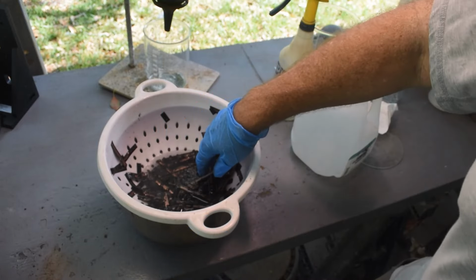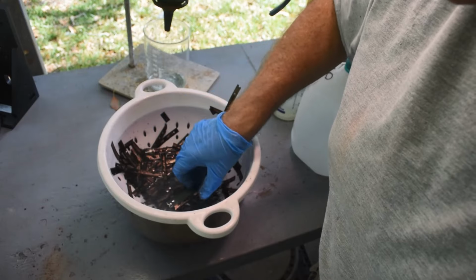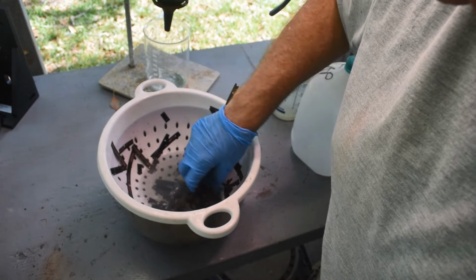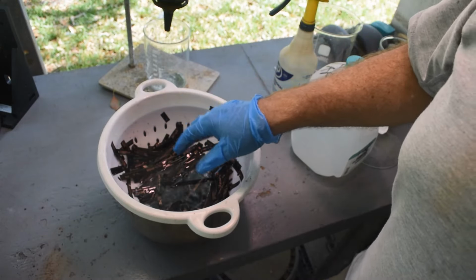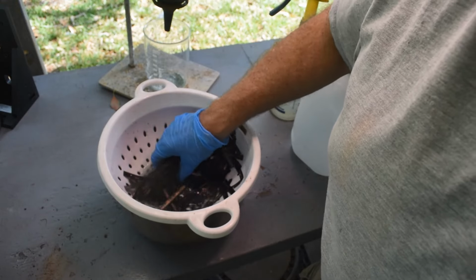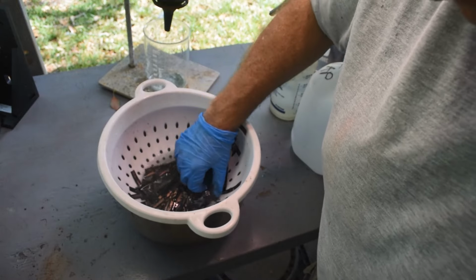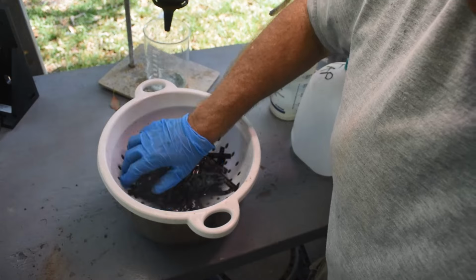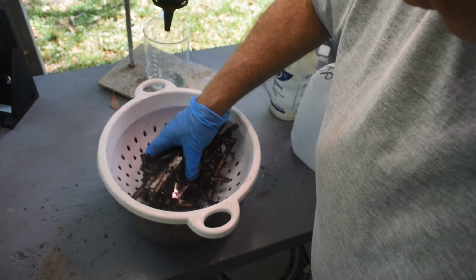I think probably this stuff could have cooked in nitric acid a little bit longer, because I do see a few places where there's still some palladium stuck on them. But it's kind of a delicate balancing act, getting the right amount of nitric acid in there to dissolve the nickel undercoat and some of the copper without dissolving the palladium. It's a delicate balancing act. So I think I got lucky on my first attempt at this. So Joven, feel free to experiment.